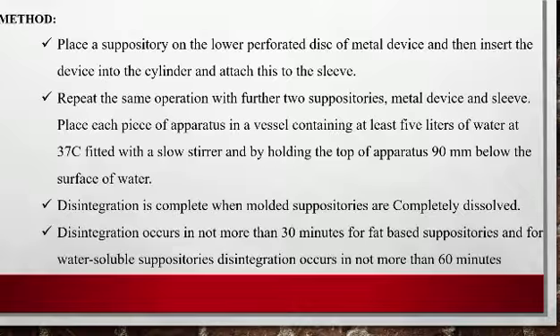The disintegration is complete when the molded suppositories are completely dissolved. We have to note the time until the suppositories are completely dissolved. Disintegration occurs in not more than 30 minutes for fat-based suppositories, and for water-soluble suppositories, in not more than 60 minutes.